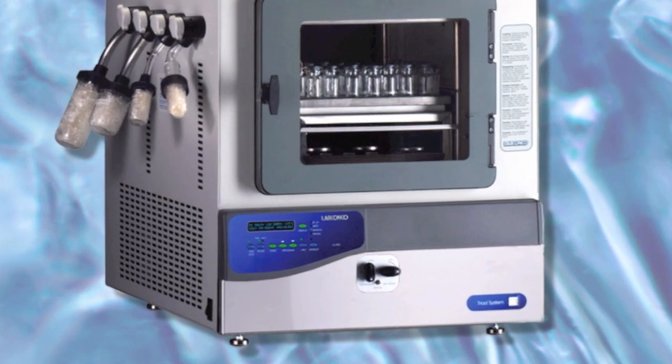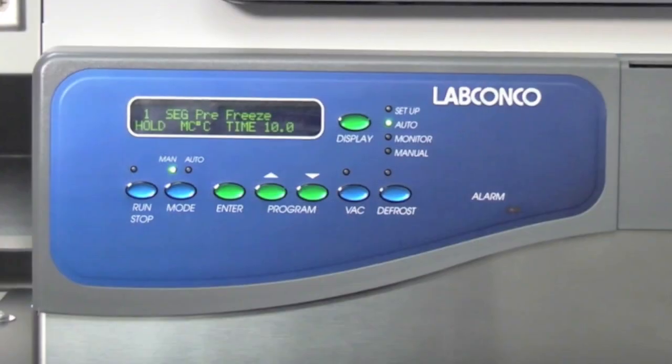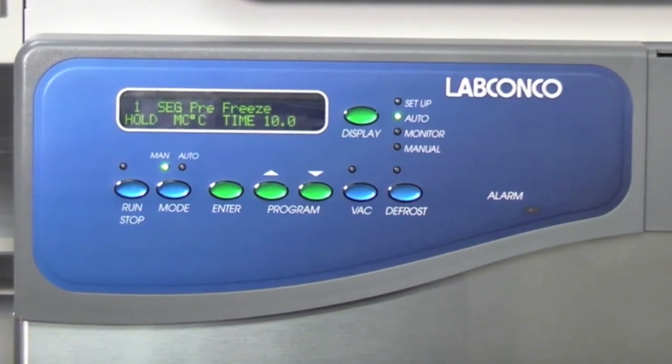The Triad is equipped with a microprocessor control that allows up to five programs with six different segments. The five programs, once programmed, will be retained in memory. Now we will program a sample program.